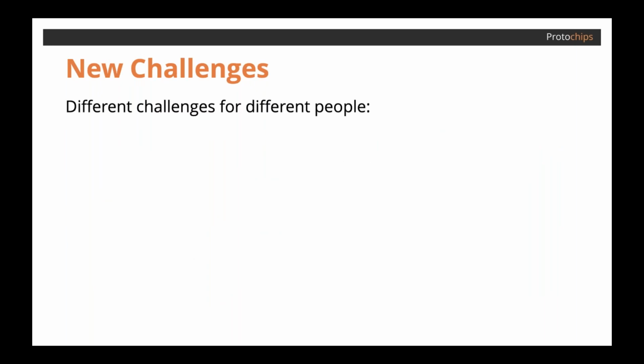So in summary, this new world brings a new set of challenges to any collaboration, big or small, and the same situation causes different challenges for each person involved. And so we'll be looking at two different perspectives for the rest of these slides.